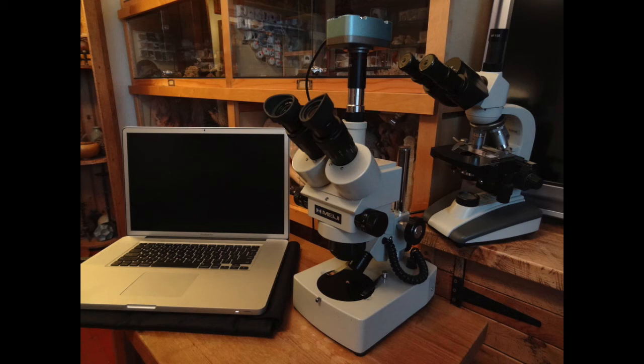Hi YouTube. This video is just going to be a very basic introduction into microscopy. If you look here, these are my main two microscopes. The one in the front is a Meiji Techno stereo microscope, which is more used for looking at large objects like coins and stamps and that kind of thing. The one behind is a compound microscope for looking at microscopic organisms.